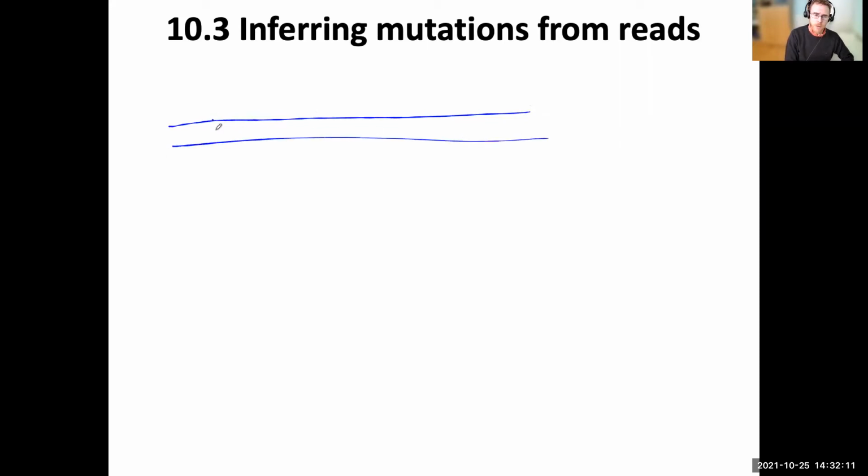then we could draw different segments that are present, like a segment B here, and then we might have a region A, and then it might be duplicated to have two regions A or even three. So imagine these are all identical, and then a region C here at the end. And if we map reads to these regions, we might get particular types of information that's present from these different reads based on their overlaps between the different locations.